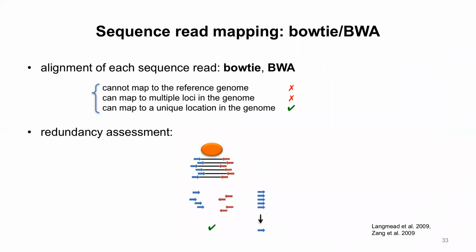And what is the average read depth you generally target in ChIP-seq? You mean average read depth, like the total number of reads you target usually? I mean, there is a certain limit for RNA-seq, right? So many reads are good for quantification. Is there something similar? Oh yes.